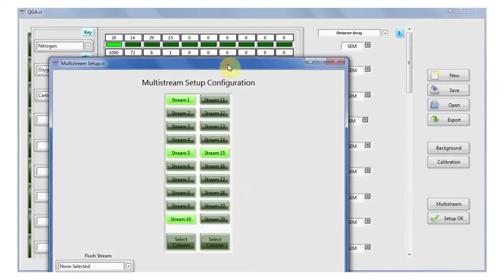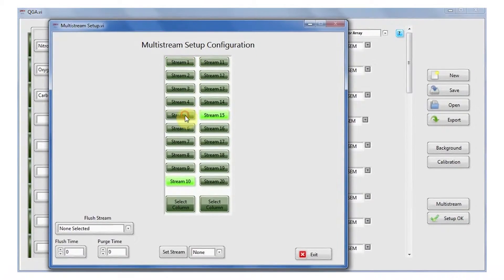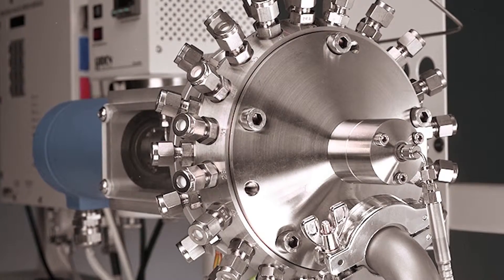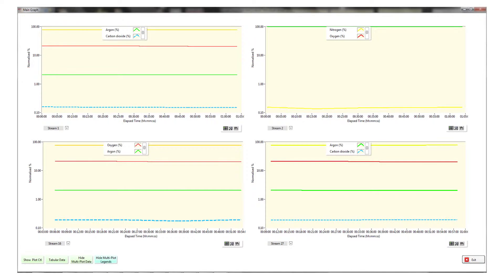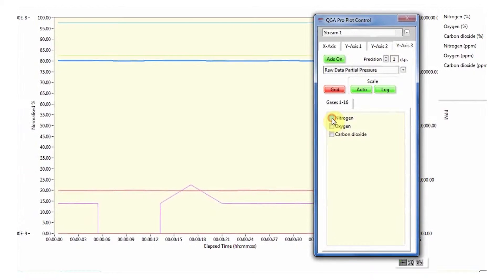The QGA is available with a range of gas analysis inlet modules, including multi-stream inlets for analyzing 4, 8, 20, 40, or even up to 80 gas streams. The software allows you to look at up to 4 streams at a time and select each stream for viewing in graphical and tabular mode.